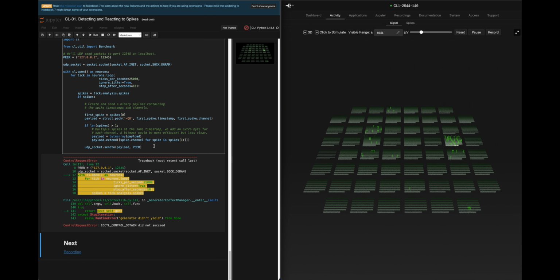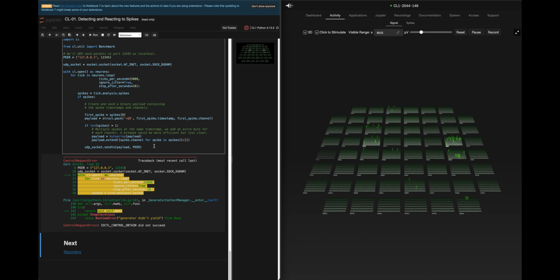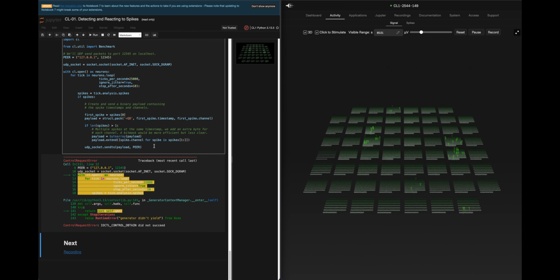It sounds really good to open a connection, start the loop at maximum speed, and be sending a tick every 40 microseconds with ignore jitter true and everything. It sounds good, but there are cases where, if you're relying on data coming from this machine, as I did in one of my demos recently, in another video, I want to keep this very objective, because this is a proper tutorial.